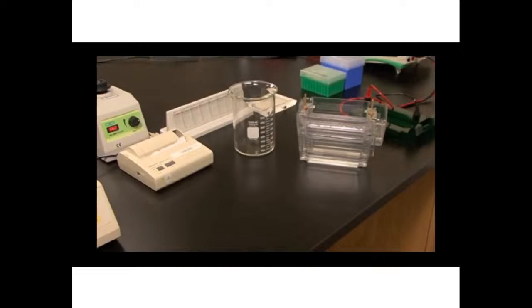We're now going to remove the gel from the Criterion cassette and prepare the gel for staining. Remove the gel from the gel box, pour out the upper buffer, and open the gel by using forceps or a similar tool, pushing the forceps against the plastic cassette towards you at the top and working your way down. So fold open like so.